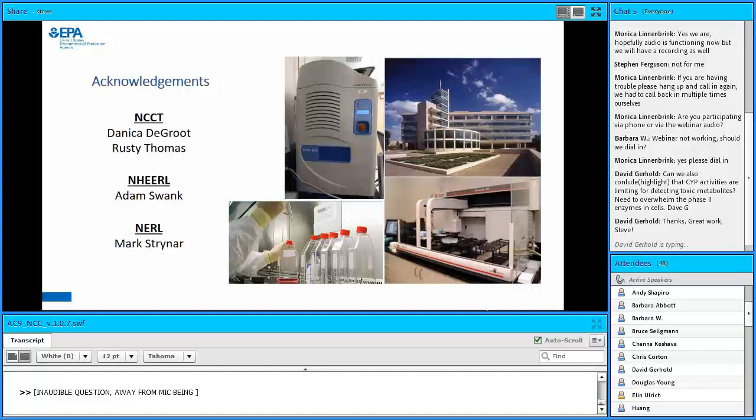Right. So the question was, basically, there's a heterogeneity of cell types in liver, or in any tissue for that matter, and there are geographical differences with respect to oxygenation levels and metabolic competence even within the same tissue, creating these zones. And the question was, is there any way we can look for that? And that gets back to that slide I showed earlier with the big canyon, with high-throughput toxicity testing on one side and metabolism on the other.